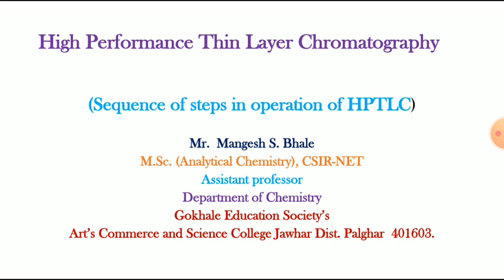In the previous lecture, we have seen the introduction and principle of HPTLC. In this lecture, we are going to learn the sequence of steps in the operation of HPTLC. That means when we operate the HPTLC instrument, what are the steps we have to follow? That is what we are going to learn in this lecture.